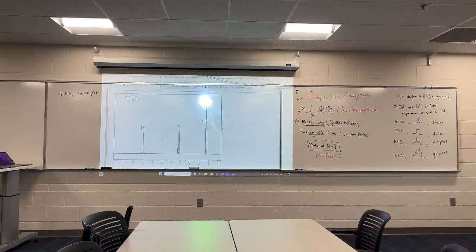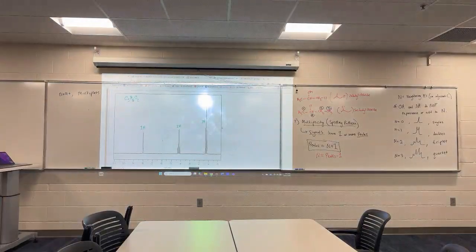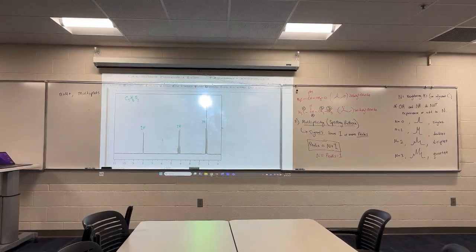Honestly, I always forget about that. At least I just talked about that yellow graph. But you can see how it's way more detailed. Almost too detailed. Yeah, yeah. Well, then notice how most of those overlaps are all functional group adjacent. Yeah. So what does it help?